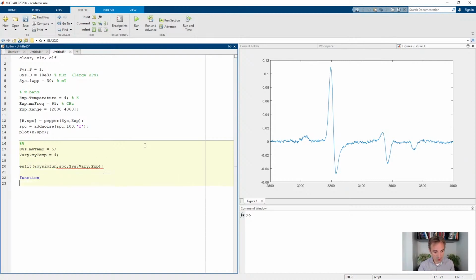And so let's write this function again. We will have to return a spectrum, which is probably better to call this spec_exp to make sure it's a spectrum. So my sim_fun here, it takes system, system, exp and opt, and let me regenerate this data here and feed the extra experimental data.